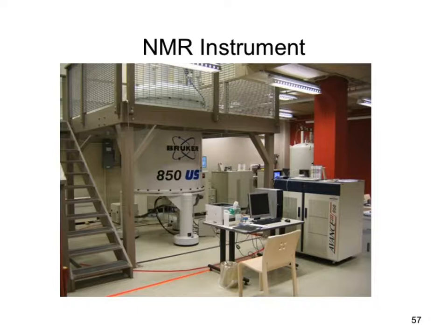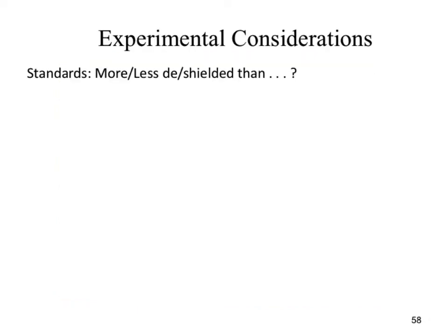What's around that magnet right now is increasing layers, starting with, I believe, liquid helium, moving up to liquid nitrogen. Okay. Liquid helium boils at about 4 Kelvin. That's really cold. Okay. Really expensive. To run these instruments, you have to have those cryogens to keep it running. Okay. Which means you can get hired to be the person to fill up the instrument. Okay. You just got to pour the really cold stuff in. Not that big a deal as long as you don't pour the wrong liquid into the wrong hole. Okay. That usually causes big issues. I've got stories about that one too. Okay. I didn't do it.